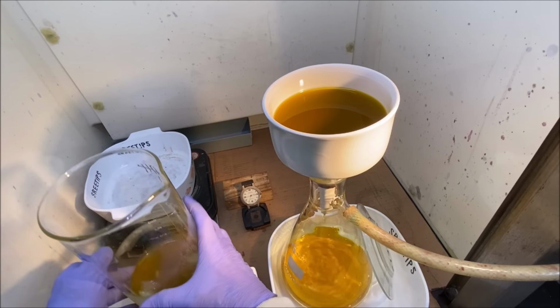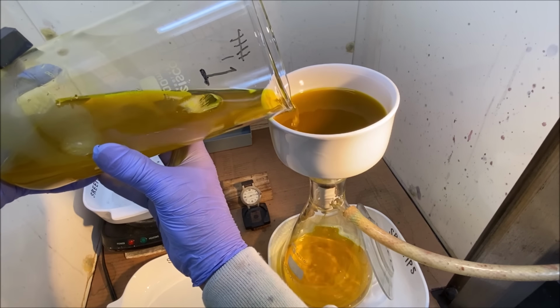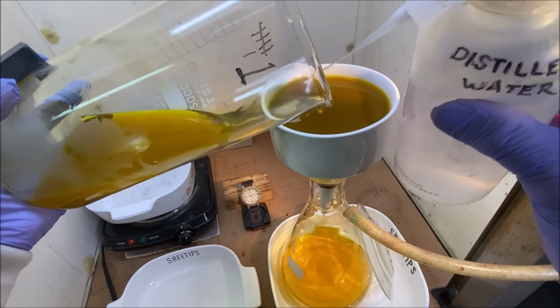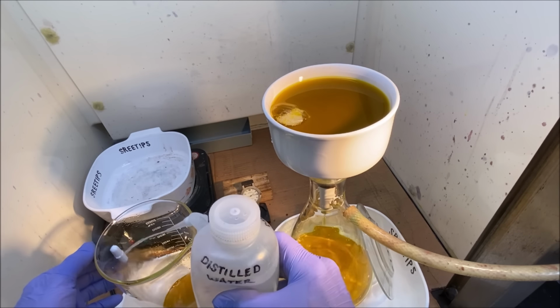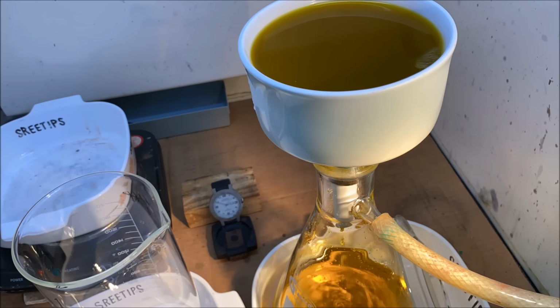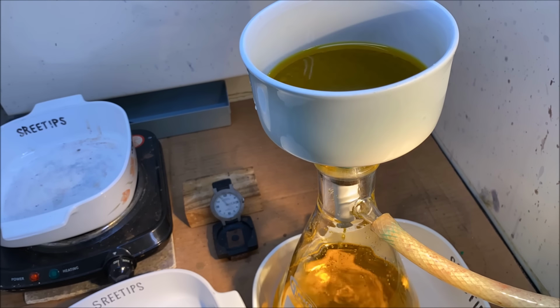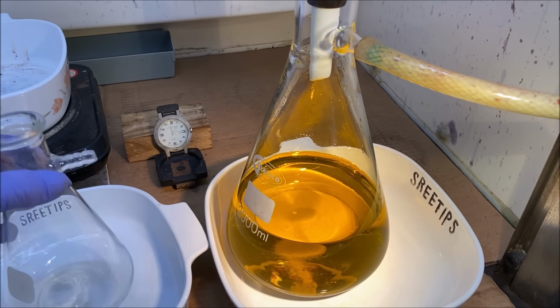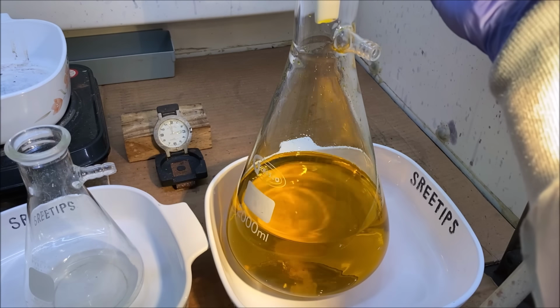I added a couple pieces of ice to this, and thankfully it's pulling through the filter very quickly. Solution looks beautiful. So what I'm gonna do here is we're gonna put the funnel. I haven't rinsed it yet.